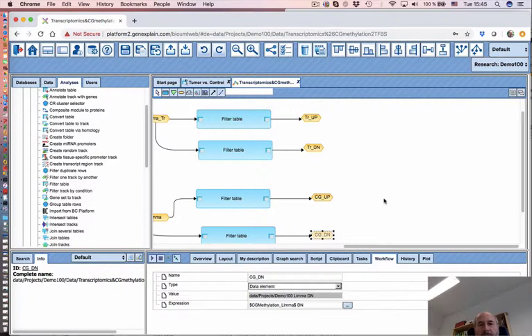So as we described before, we want to select promoters of these upregulated and downregulated genes and check which genes contain in the promoters the methylation points, differentially methylated CG nucleotides. So for that we have to convert these gene lists and the accession number list into the genome coordinates, so-called tracks.